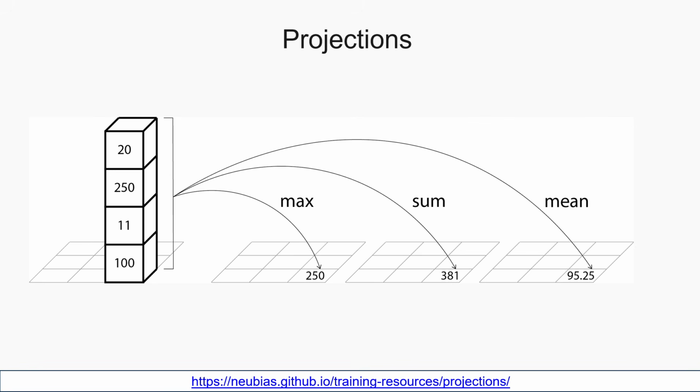However, projections should be used carefully because information about depth or dimensional relationships may be lost during the process. The usefulness of a projection depends on the scientific question being asked or whether specific tools require a way of compiling the information across the dimensions.